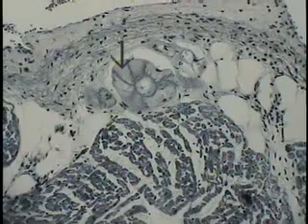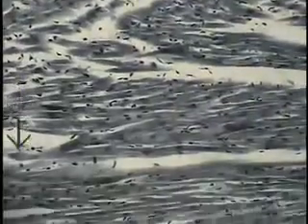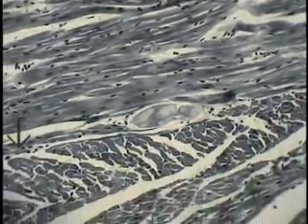Having made that type of observation, beginning on the interior surface with the endocardium, which is this layer here, by the way, again go through the myocardium at increased magnification, looking at the arrangement of the cardiac muscle cells. Again, realizing that they're cut in various planes, that it's an extremely vascular type of tissue, with each cardiac muscle cell having vasculature on either side. And one gets an appreciation going through the entire muscle wall of this interwoven nature of the cardiac muscle cells.